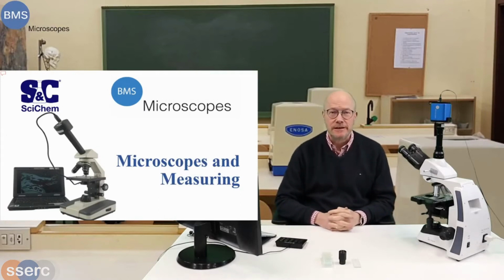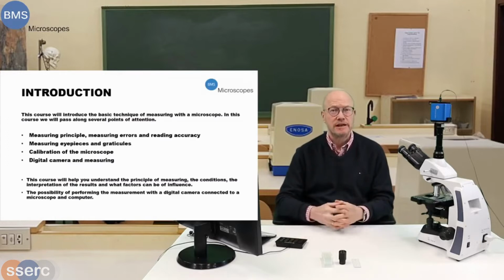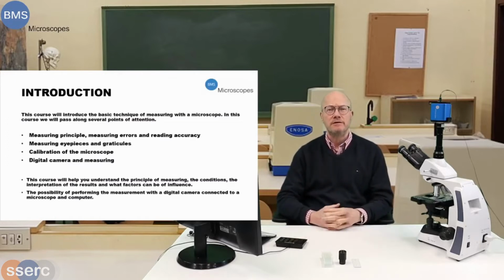Welcome to this SciChem and BMS microscope course, Microscopes and Measuring. We're going to show you something about microscopes and measuring, as we said. First, we tell you something about the microscope principle. What do you do when you start measuring inside a microscope? We tell you something about the eyepiece, the graticule inside the eyepiece. We show you how to calibrate the microscope manually.